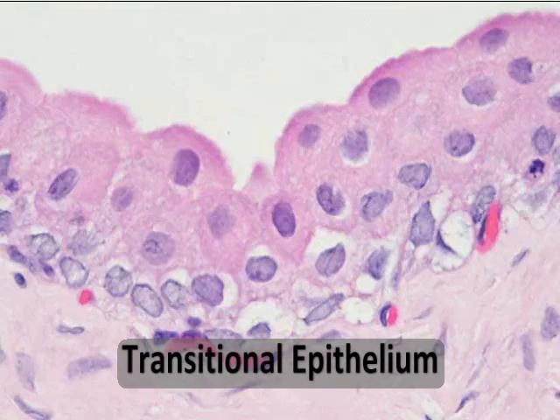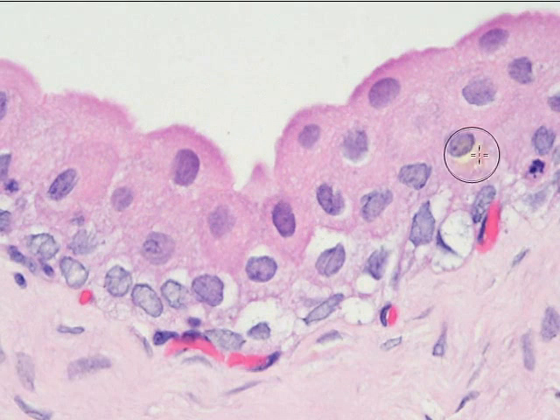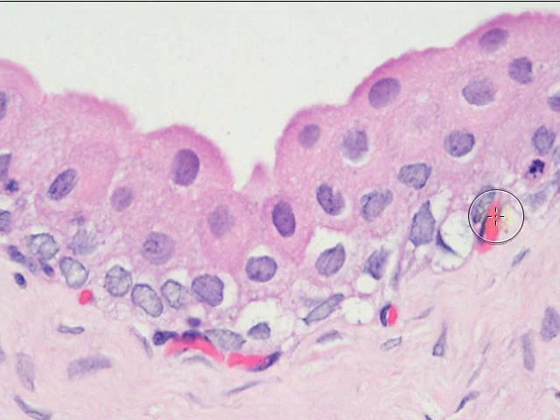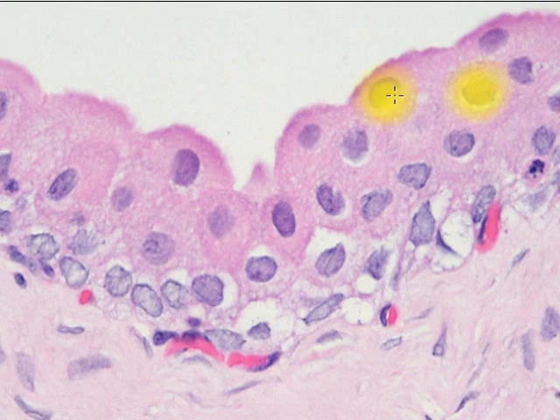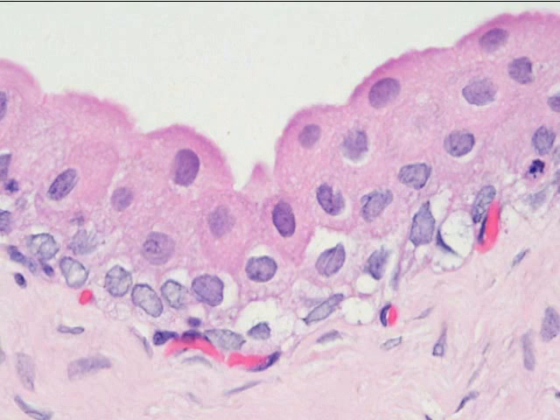Our next epithelial tissue is transitional epithelium, and when you look at this tissue, it doesn't really have any one distinct shape like the others have. It sometimes looks when it's stretched out like squamous tissue, and when it's more relaxed like we see here, it resembles more cuboidal cells. We see the nucleus and kind of the roundish cell.